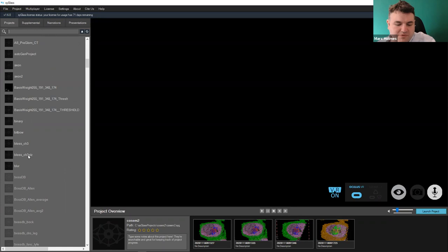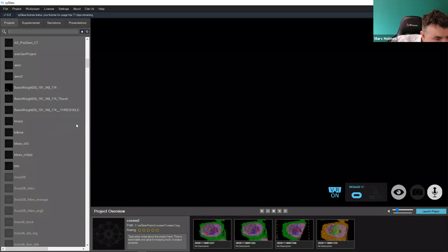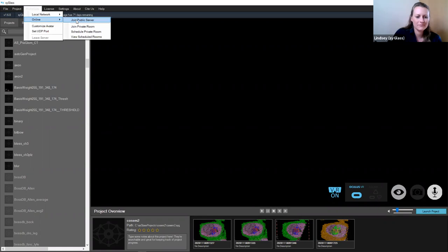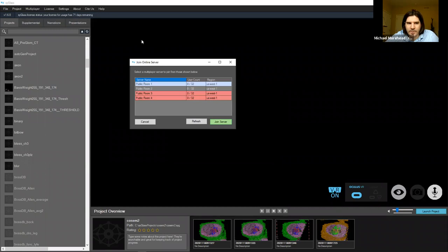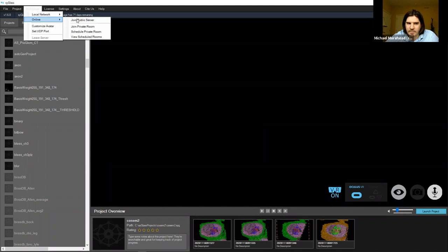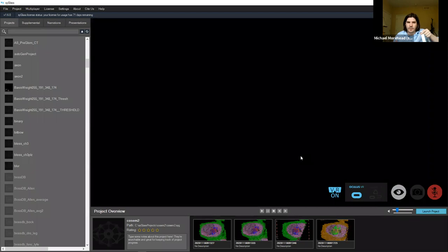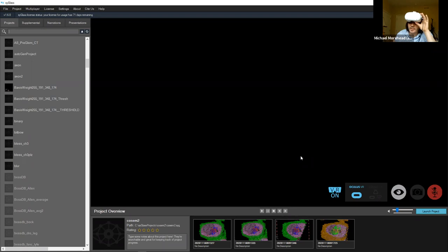Should we try to get into VR? We can just jump into the public room for ease. If everyone has Syg lass up, go to multiplayer, online, and join public server — let's try public room number one. In multiplayer everyone comes in muted, so since some people won't be in VR let's just use the Zoom audio rather than unmuting inside Syg lass.